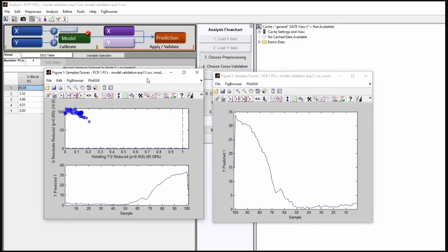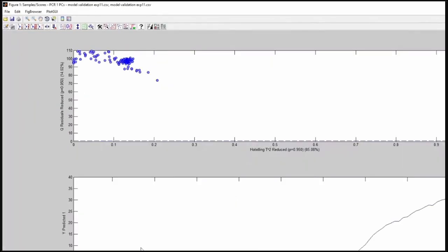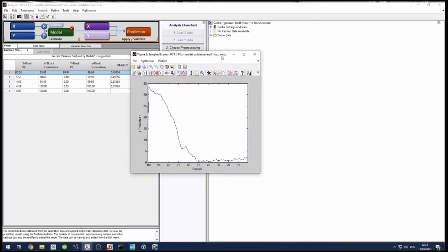On the left here is the result of the principal component analysis. What we're looking at here is the residuals that were mentioned. It will probably be difficult for you to see the details of the graphs, as unfortunately that doesn't zoom in on the graphs themselves. But suffice it to say that these are statistical measures of how well the component of interest tracks with concentration. What we can see is that at the start of the experiment, it measured approximately 35, in fact we'll call it 34% concentration, and it dropped down to about 2 or 3% by the end of the experiment. So if that's correct, then what we should see is a change in the total concentration of 32% of the API.